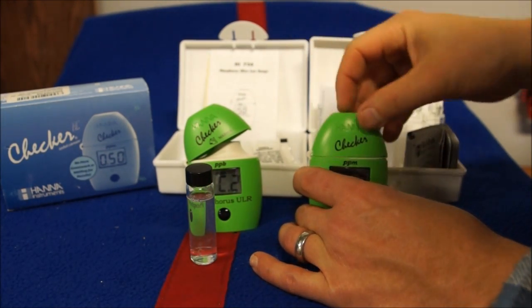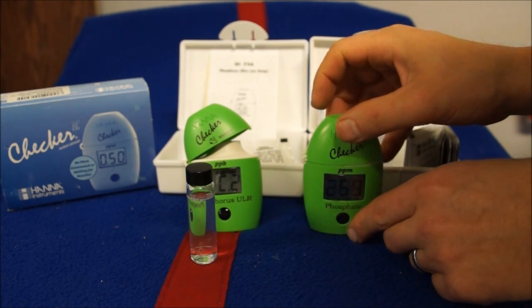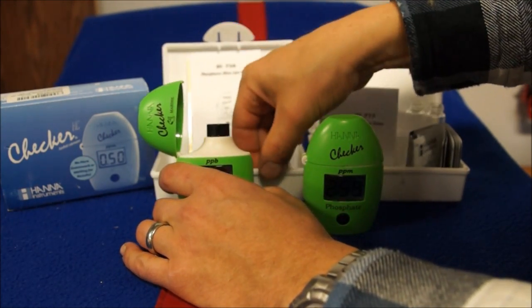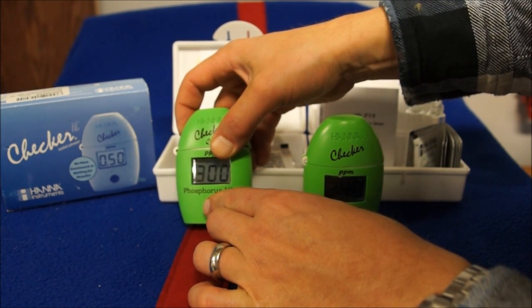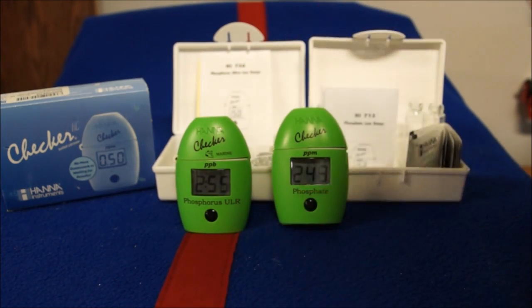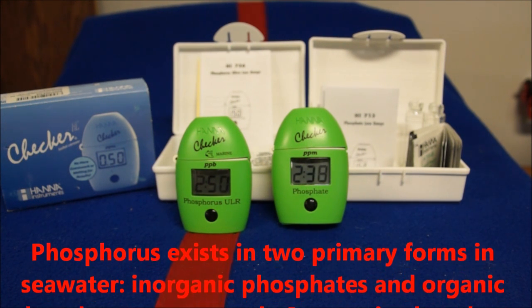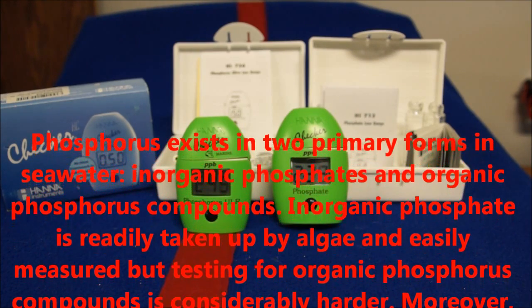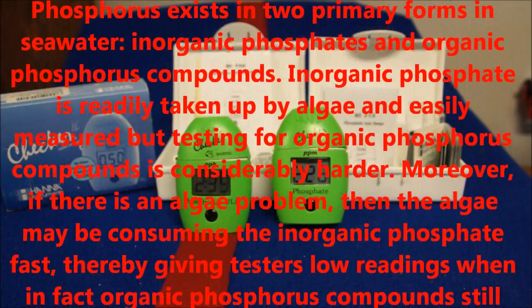I've shaken both up for a couple of minutes and now we stick them back in the testers, push and hold the button, and it gives you a three-minute countdown. I'm doing that for both, running the same water sample with each checker's designated test packet, and then you'll see the different results. The phosphate checker has accuracy, but it's not as good as the ultra low phosphorus one.